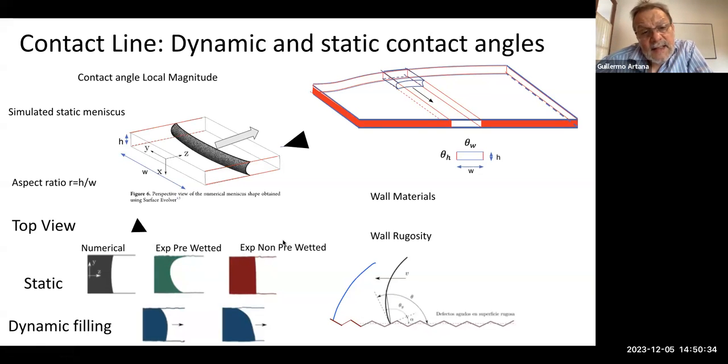If you have previously passed a little bit of liquid, or if you suspect that there is a thin liquid film existing on the channel, you may have different results for the meniscus.